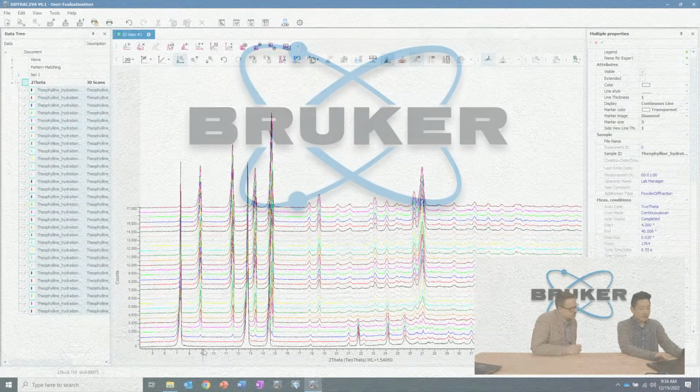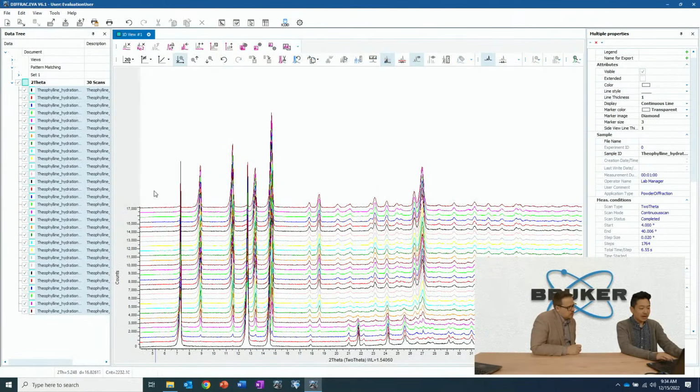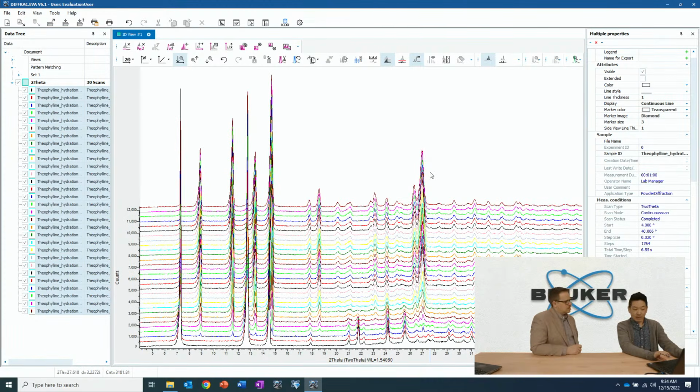And so that's what we're seeing here, is we're actually seeing a difference between crystal structure forms, one of them in anhydrous form, the other one is a hydrated form. So you are incorporating the water directly into the crystal structure. And so that's what we're seeing showing up here. So the waterfall plots I really, really like because I think it's a good way to digest a lot of information very, very rapidly.